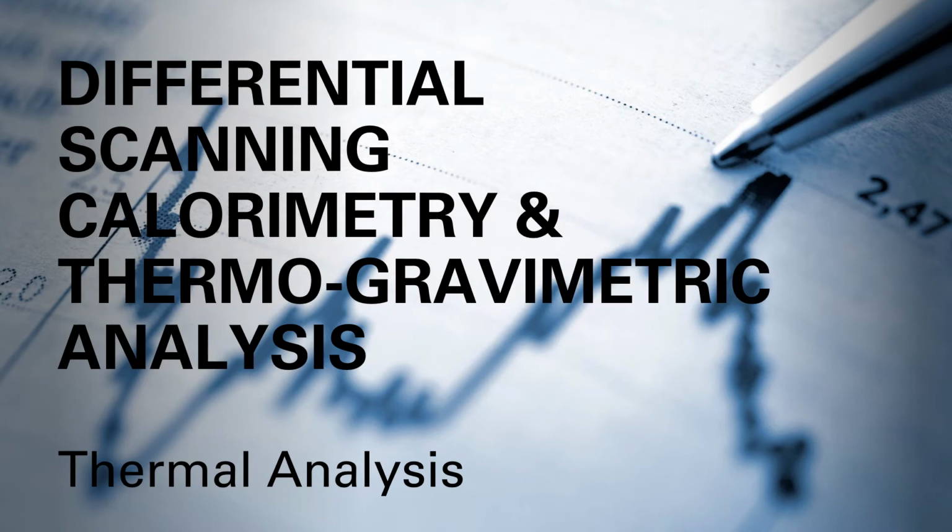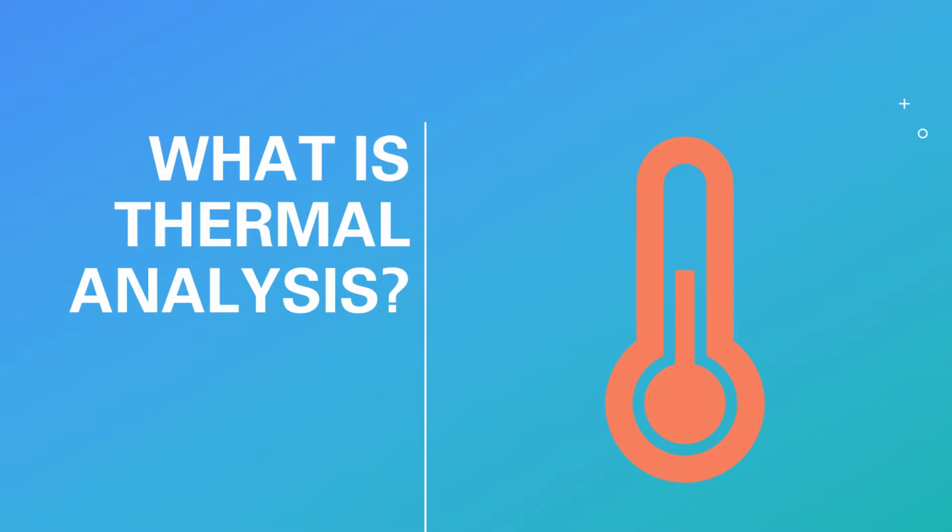Good day everyone, and for today's video, we are going to talk about thermal analysis and the two techniques we have, namely differential scanning calorimetry and thermogravimetric analysis. Before we talk about the two techniques, we first should know what thermal analysis is.